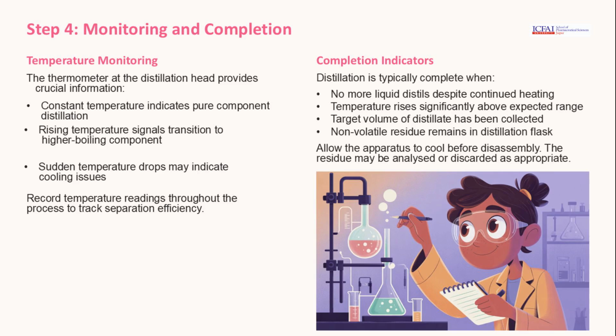Monitoring temperature at the distillation head provides crucial information about the distillation process. Completion is indicated by the absence of liquid distillate, significant temperature rise, and the presence of non-volatile residue, ensuring the process is efficiently tracked and completed.